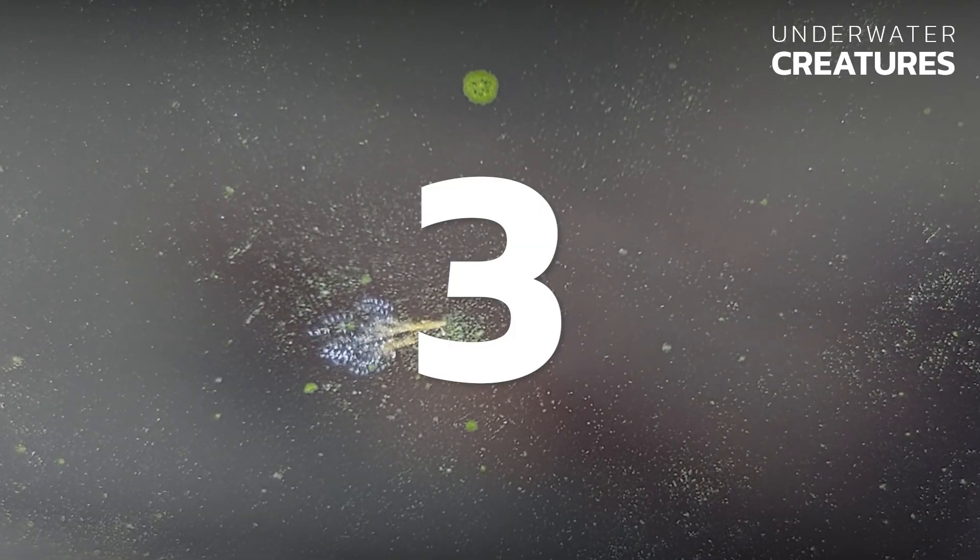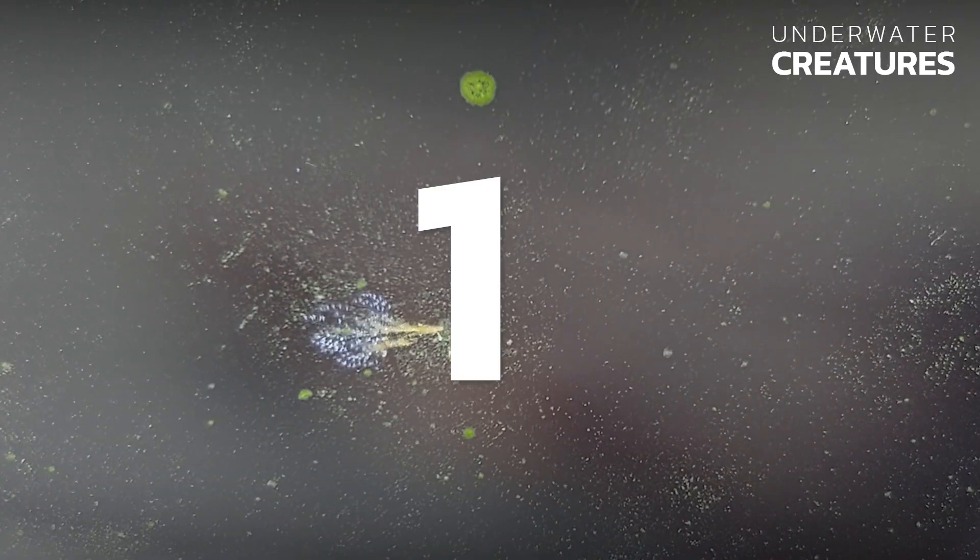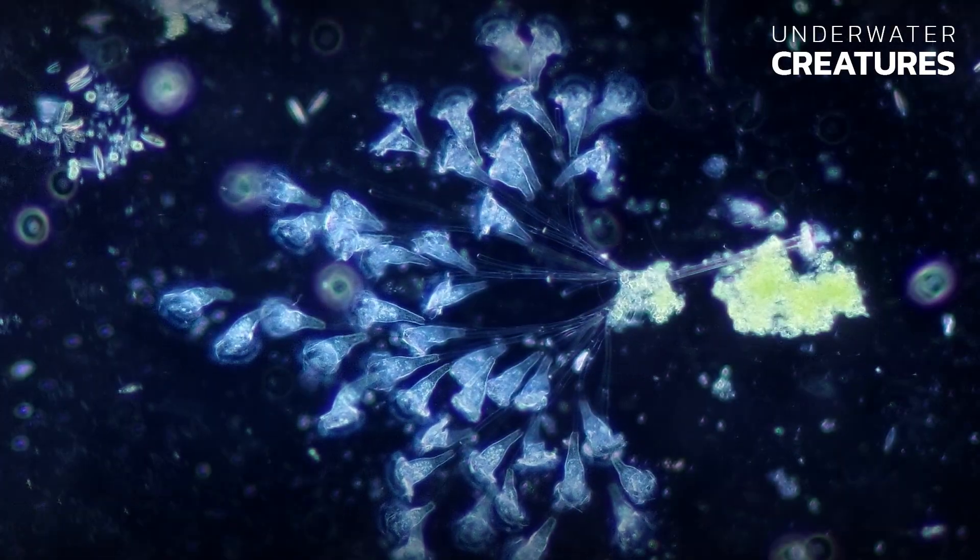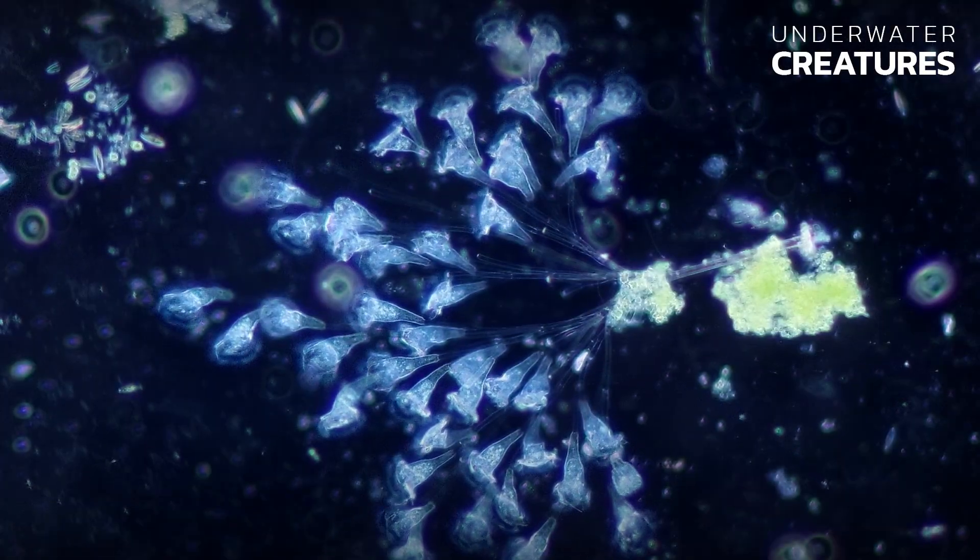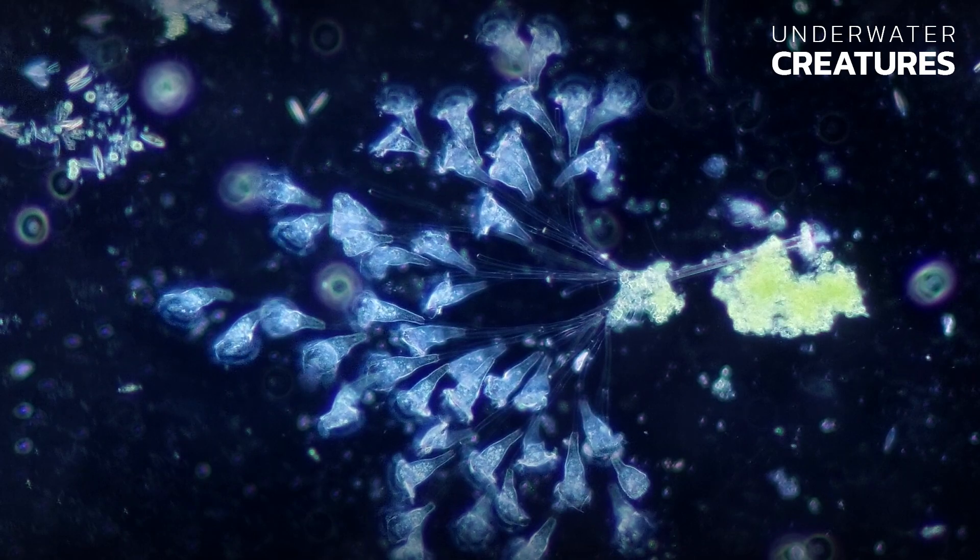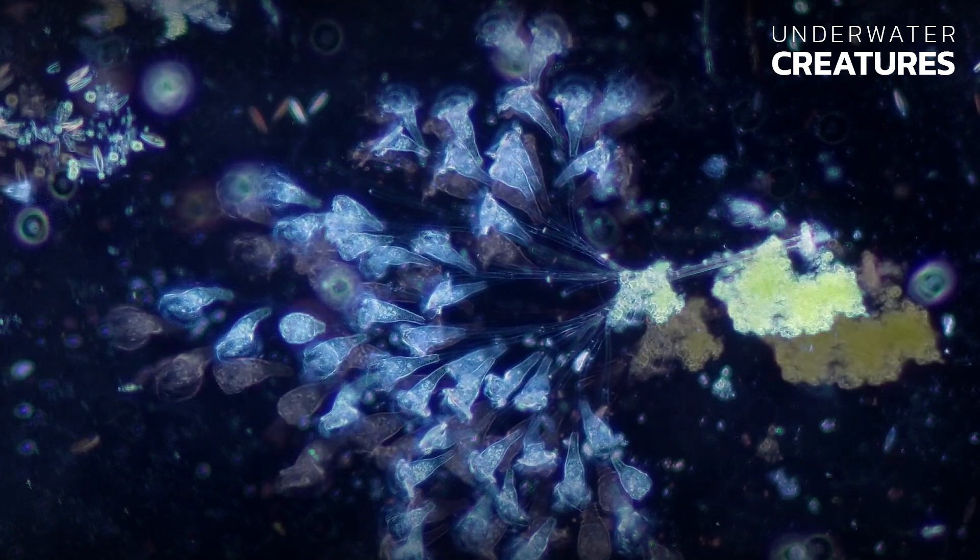Get ready to be stunned in three, two, one. Isn't it beautiful? Carchesium sp. are ciliated infusoria of the family Vorticellidae belonging to the order of Sessilida, which proliferate and form colonies resembling bouquets of flowers.